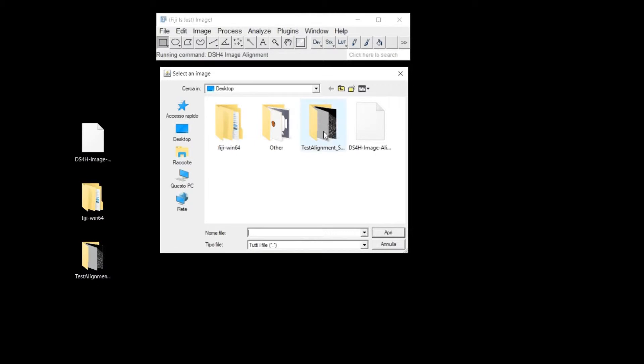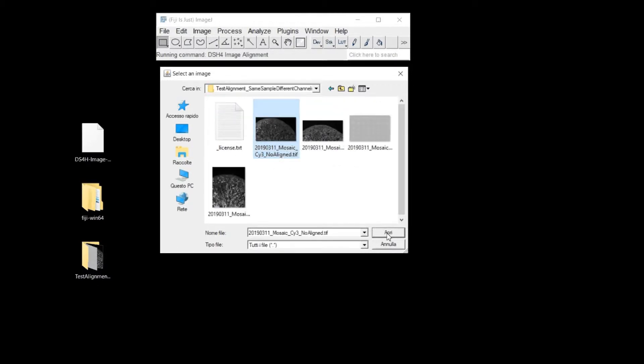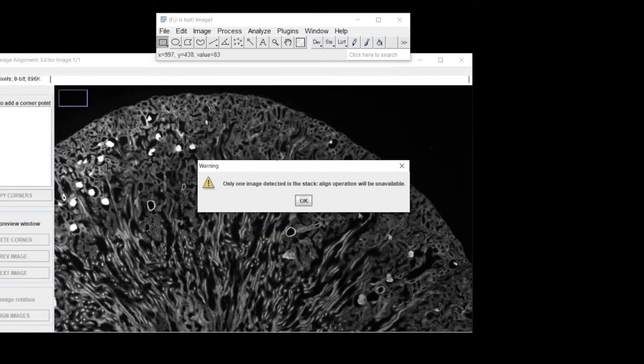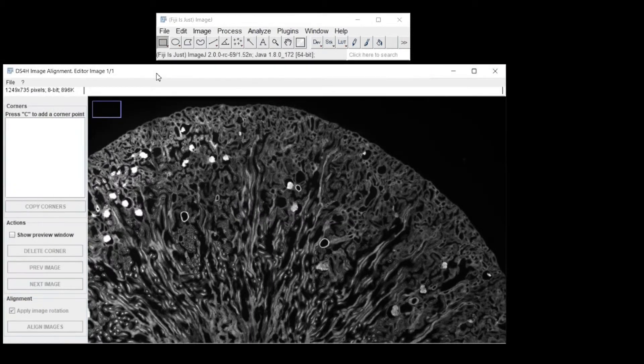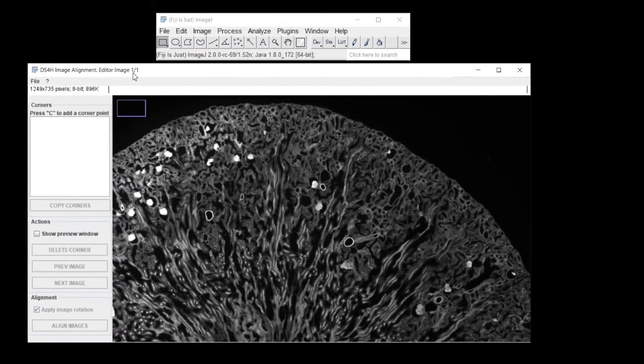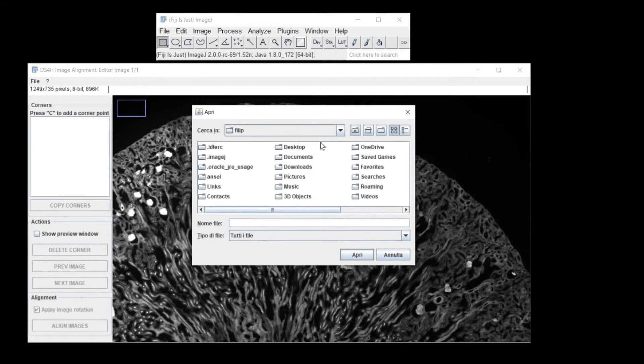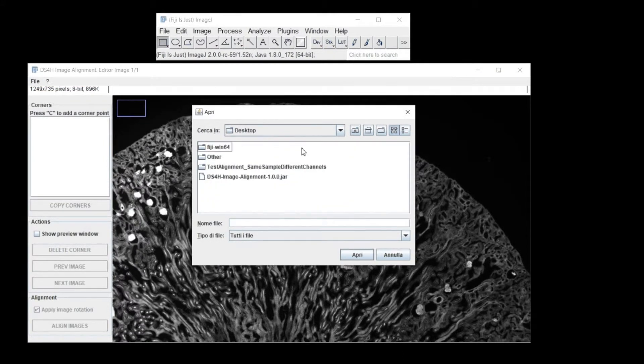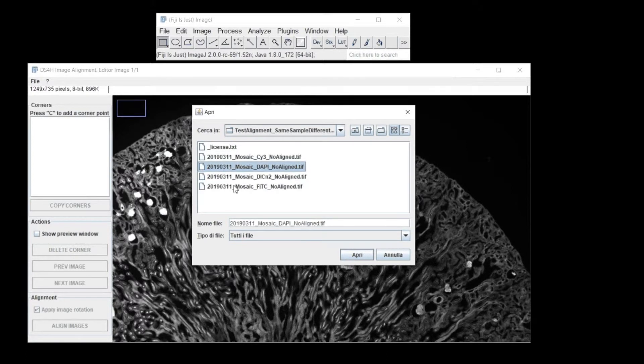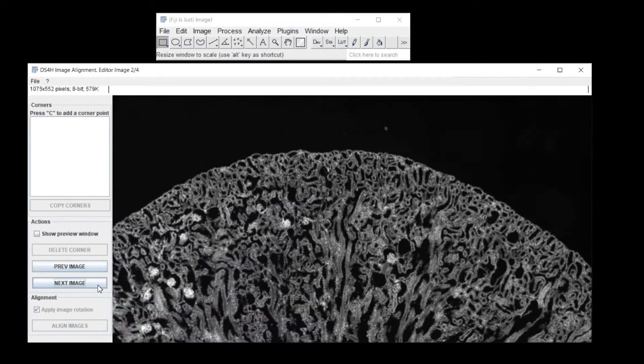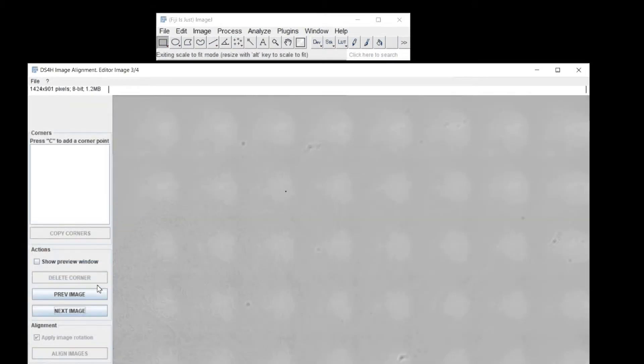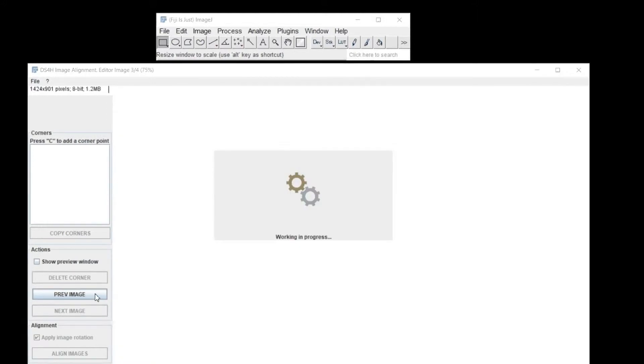You have now to select the first image you want to open. Then, with the Add Image to Current Stack button in the File menu, you can load all the other images you want to align. Do not worry. If the files are multi-page images, all the channels will be automatically loaded.